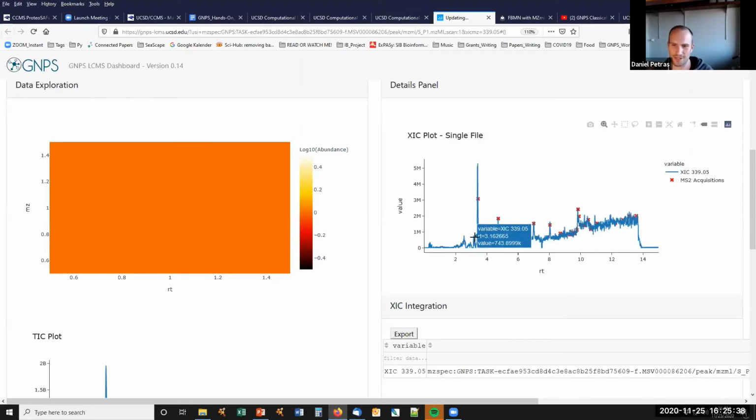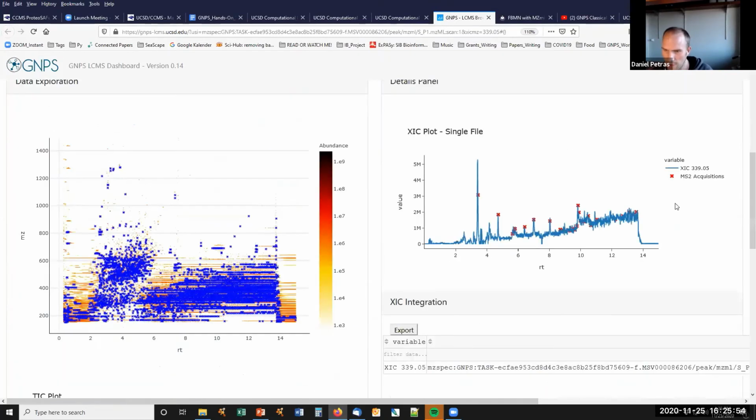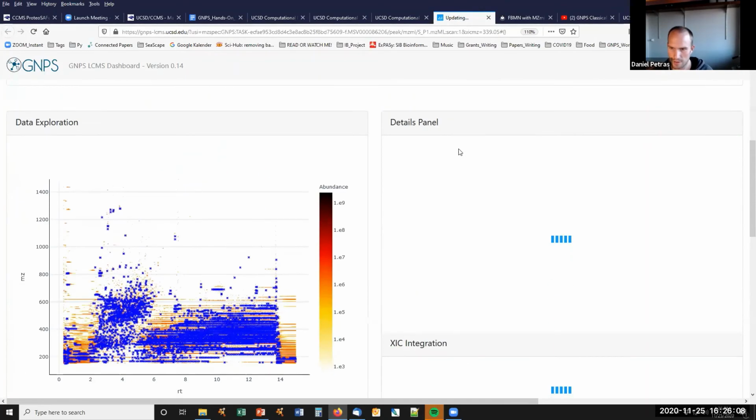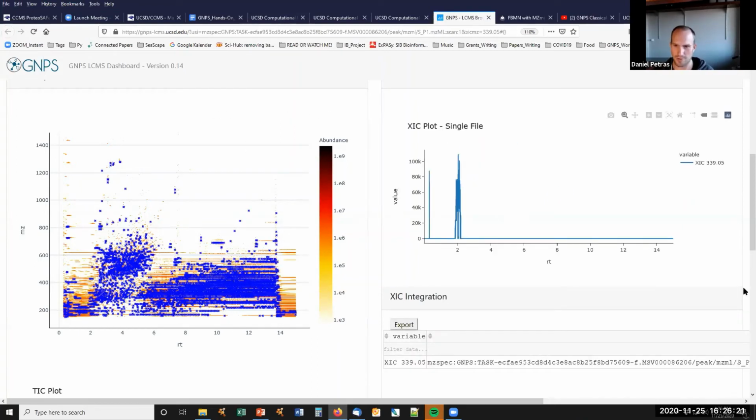Okay, right. So here we see that there's one main peak, and it's a relatively bad signal to noise, so it's probably a low abundant compound. But in that case, I would assume it's only one peak, and if there are other molecules, then they may not be isomers, but could simply be isobars. I can now update the mass accuracy here, and then I should probably only get a few. As a rough suggestion, that's what I would do. So here it's only around 2 minutes, one peak.